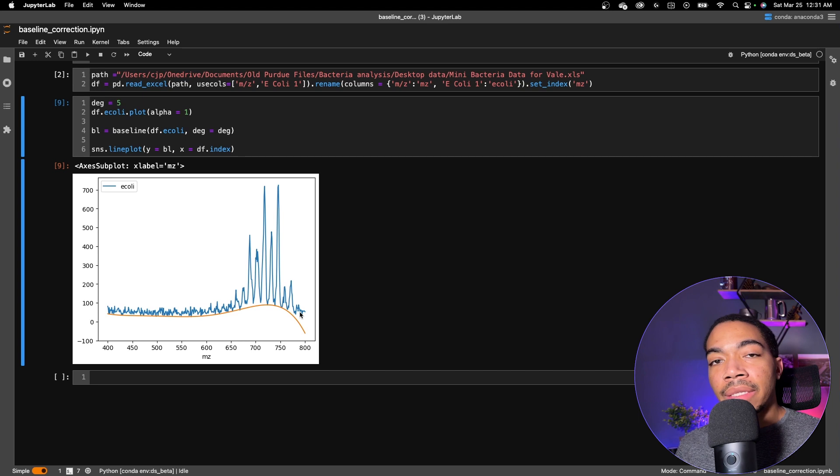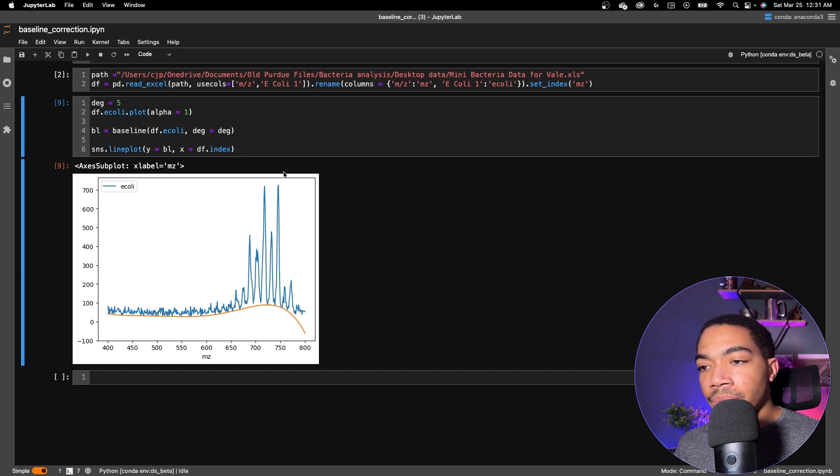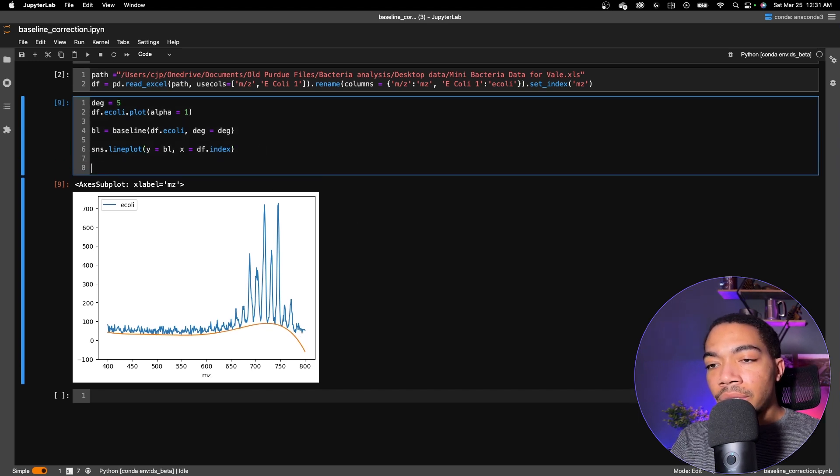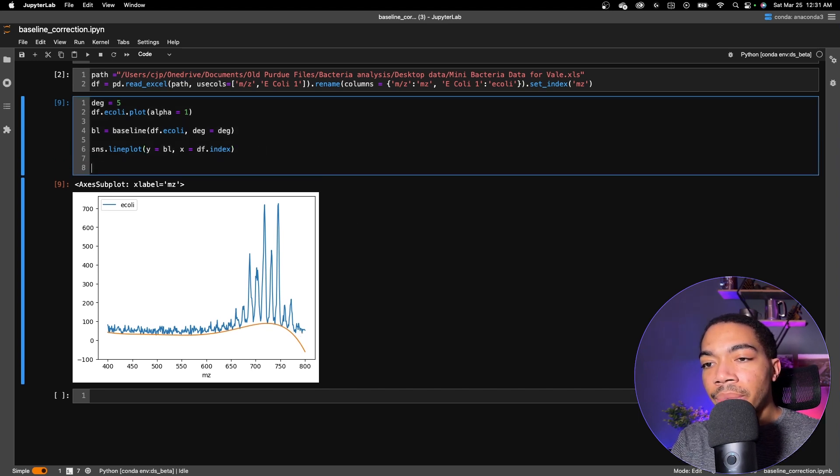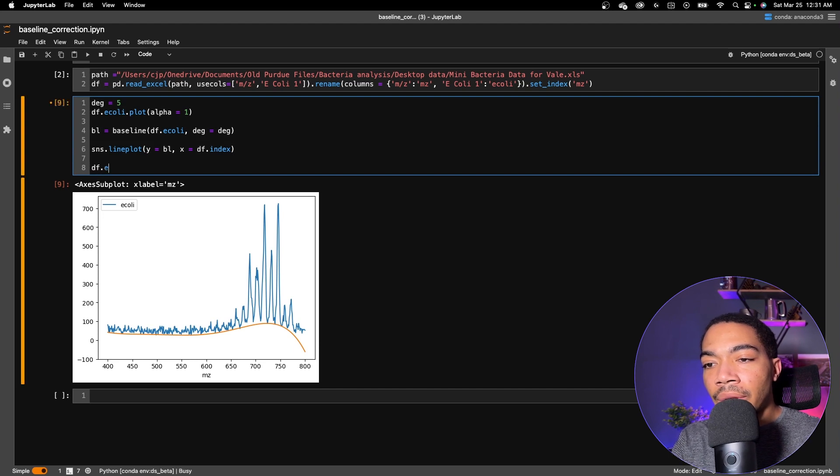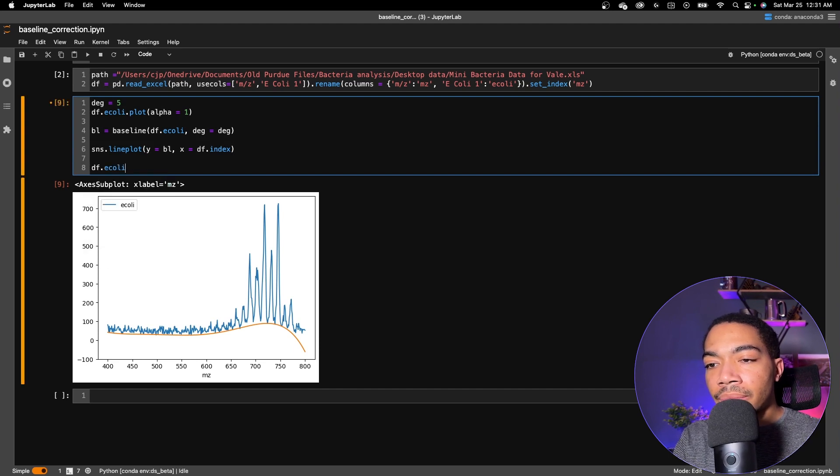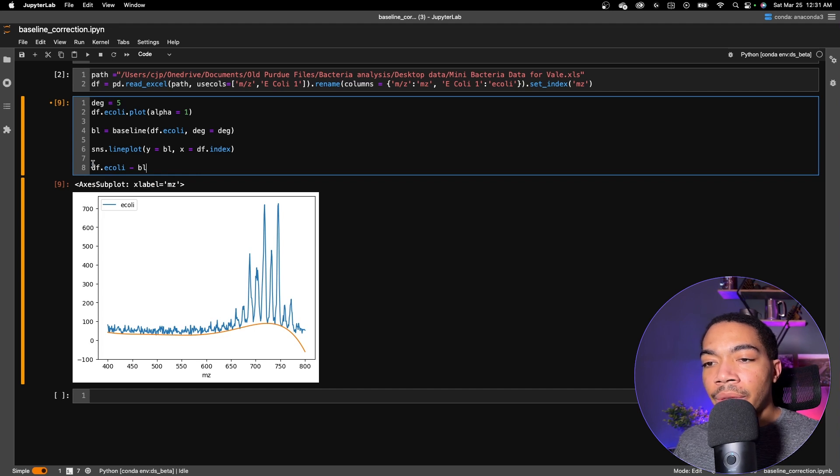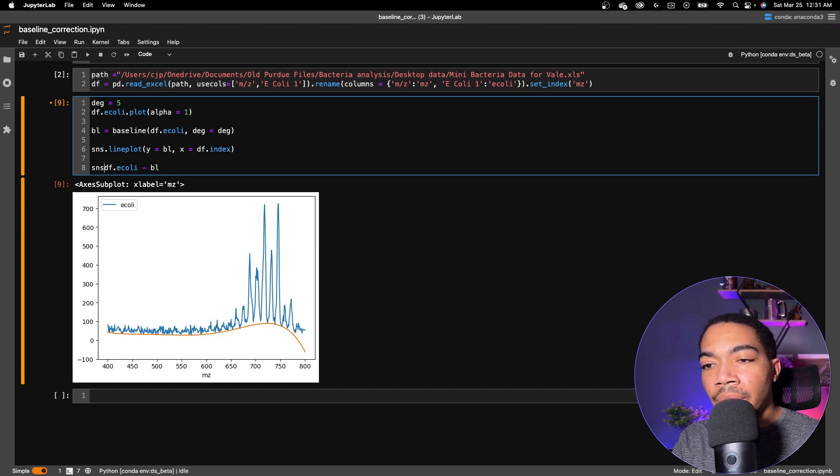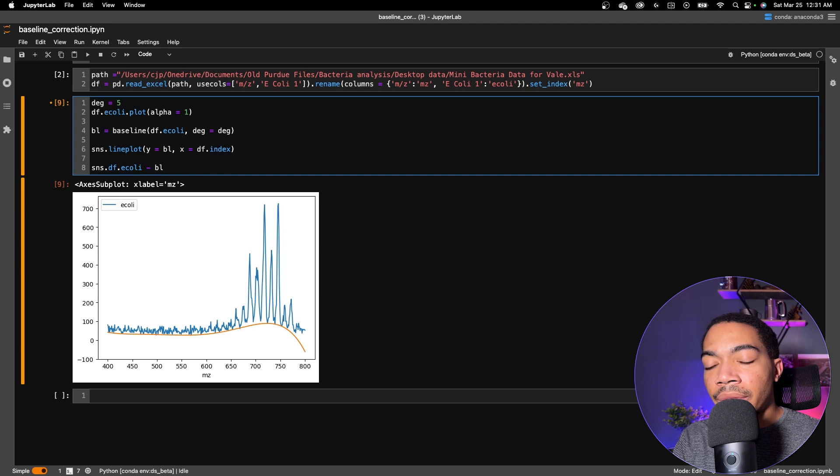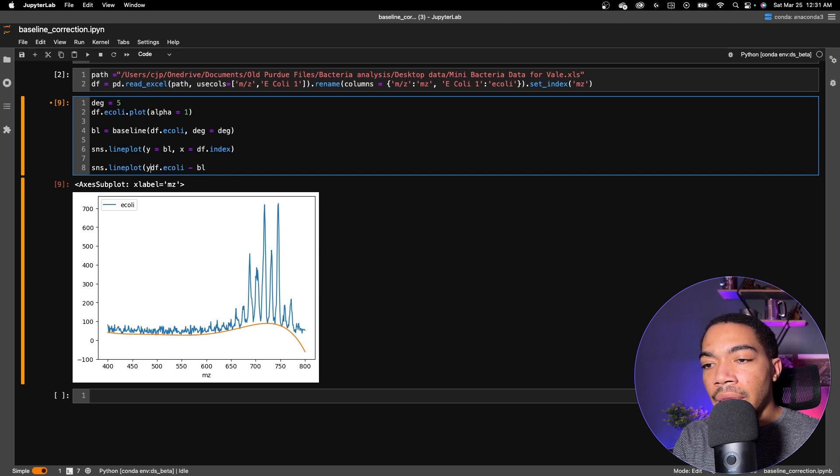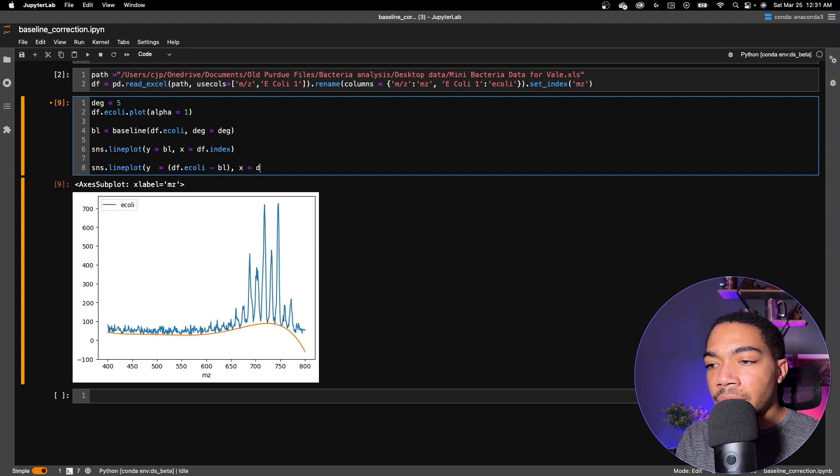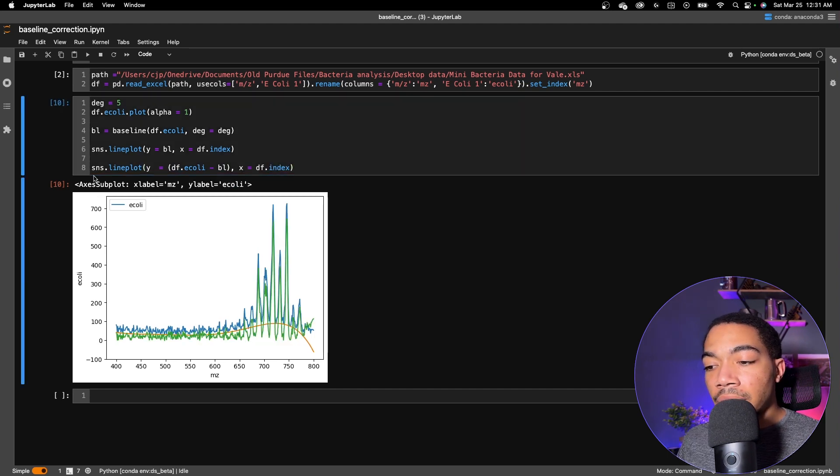And so let's see what happens if we subtract this array from the Y data to get a baseline corrected mass spectrum. To do this, we simply just take our df.e_coli and subtract BL from it. And rather than producing a separate variable, let's just make a line plot around this. So line plot and this becomes our y parameter, and then x will be df.index again. And this looks pretty good. Now you can see we have a very flat baseline.